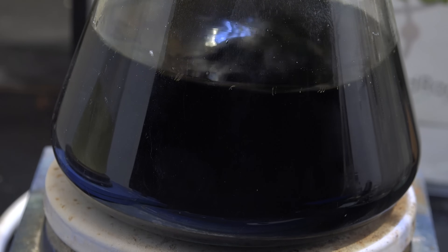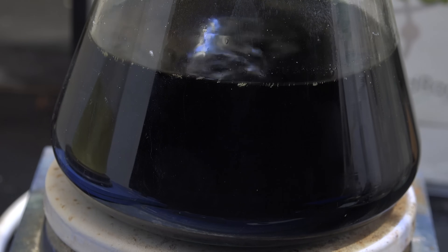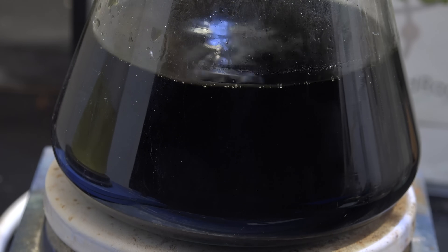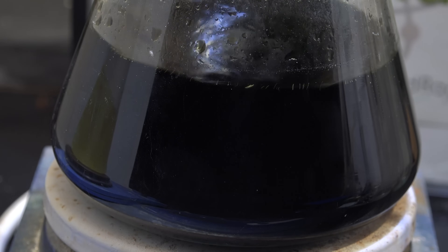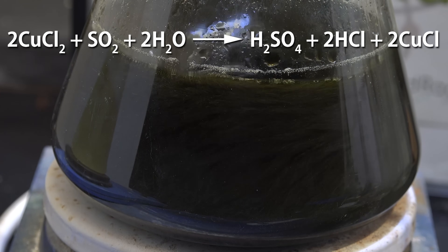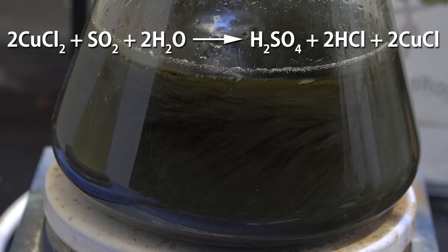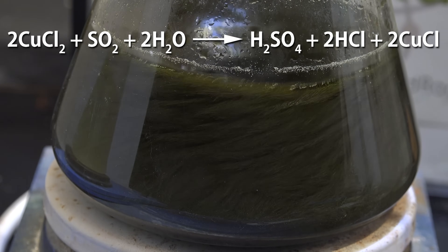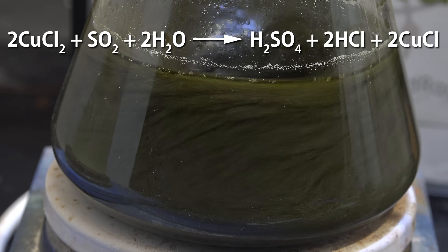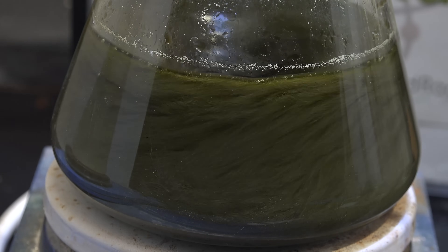Now we simply lead the gas into the solution of copper chloride with vigorous stirring. I place the tube slightly above the surface of the solution to prevent backflow. Copper chloride acts as an oxidant and reacts with the sulfur dioxide to form a mixture of sulfuric acid, hydrochloric acid, and copper chloride. The copper chloride precipitates out as this white powder you see suspended in the solution.